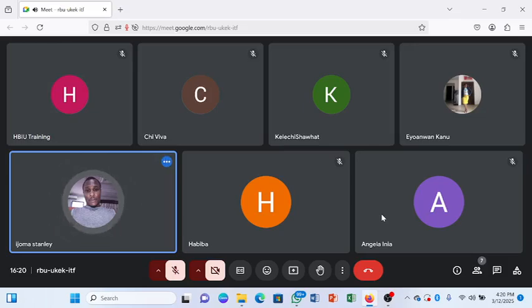and date of birth, and patient hospital identification number. Then if it's an outpatient, it must have a social security number. That's not for Nigeria anyway, but in Nigeria, I think they have a laboratory number for it. Then we have the date and time of collection of the sample, then the initial of the person collecting the sample.